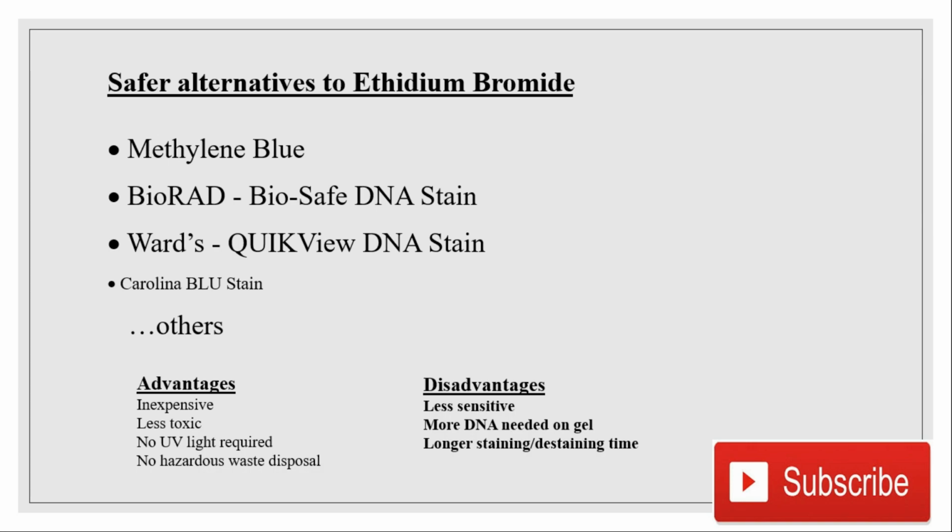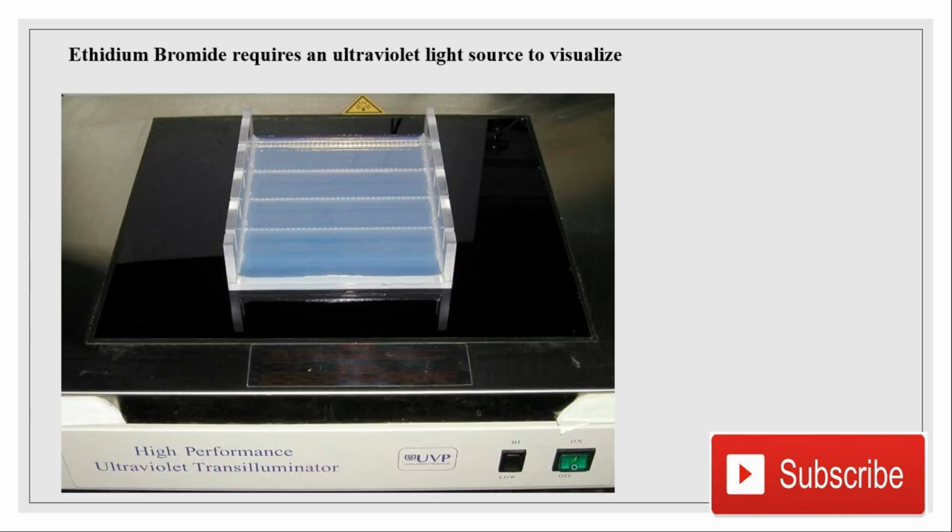So it depends upon the other replaceable staining material that you are using. So try to find another source rather than ethidium bromide. But if you don't have any other source, you can use the ethidium bromide, but precautionary measures should be adopted while using ethidium bromide.